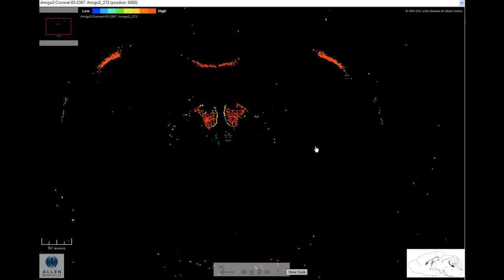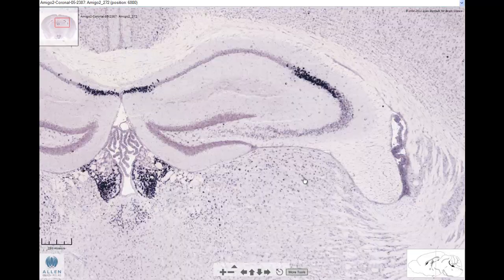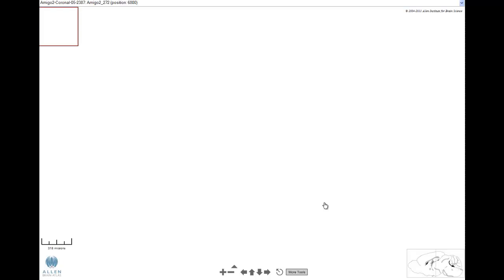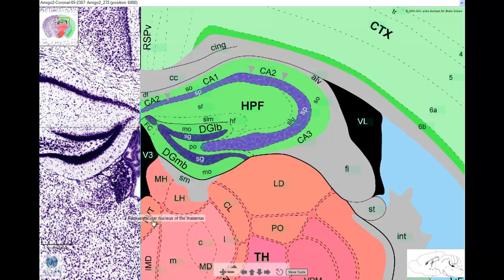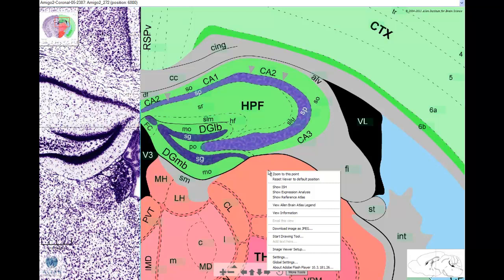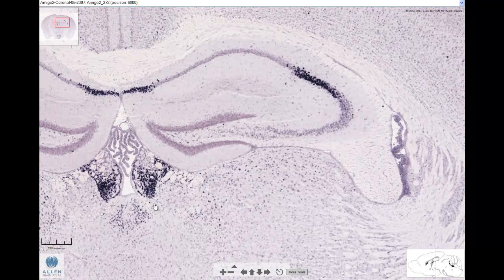From this image viewer, you can also connect to the reference atlas where you can see what regions have enhanced expression. For example, area CA2, which was the original seed voxel that we chose these genes from, as well as the paraventricular nucleus of the thalamus, the lateral habenula, and the medial habenula, are also regions that showed enhanced gene expression when we go back to the ISH data.